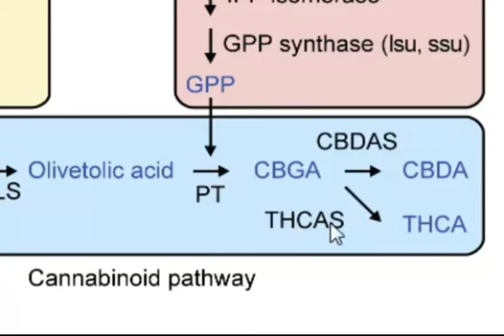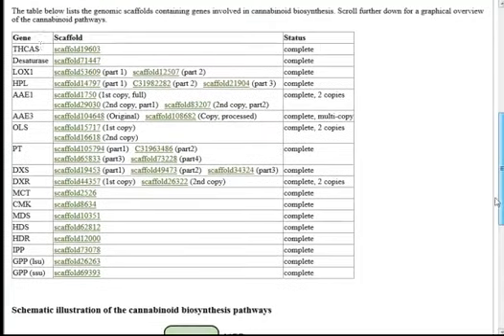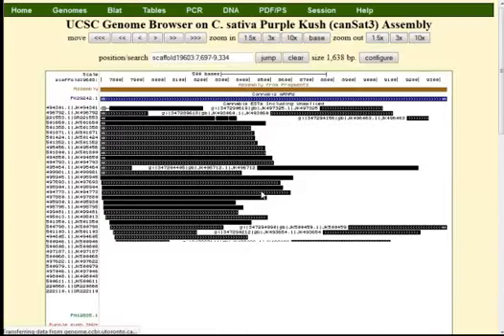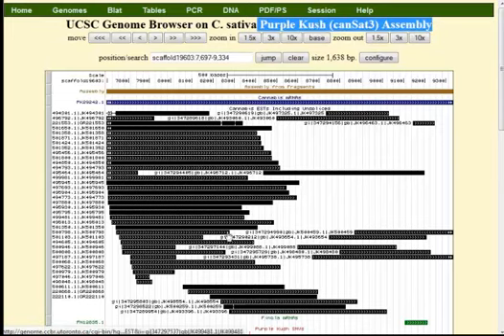In the hemp plant, you have a different pathway that ends with CBDA, which is not a psychoactive compound. So one of the key differences between the strains is this enzyme gene. I was interested in taking a look at this enzyme gene, so I can go back up to the table, look for that gene, and click the scaffold link to go to that genomic region and explore it. It's easy to click the scaffold link and find yourself in the Purple Kush genome assembly looking at that genomic region with the synthase gene.